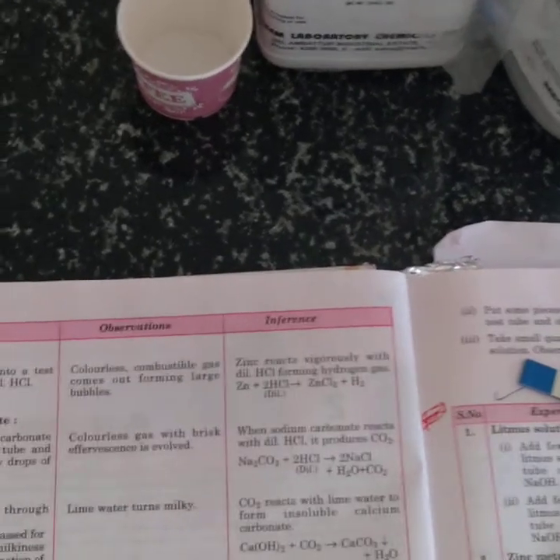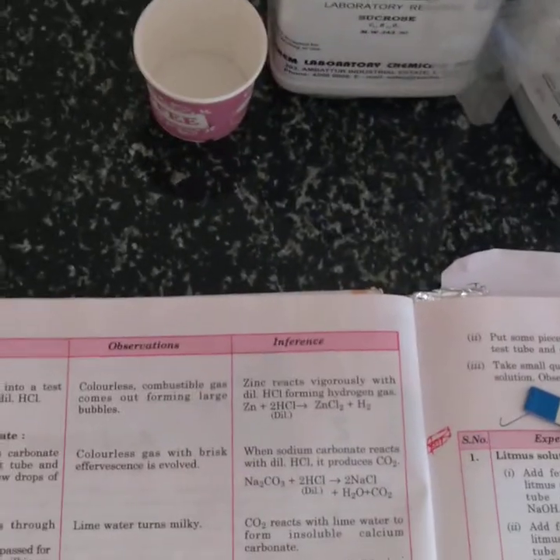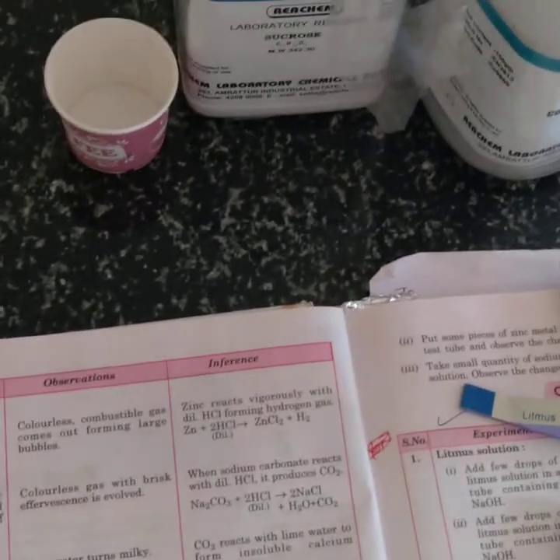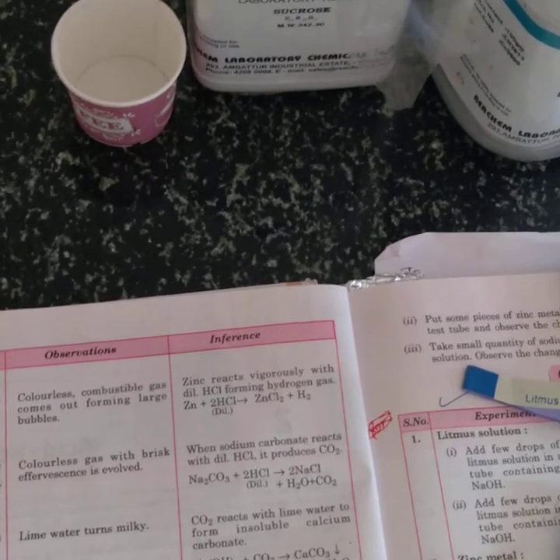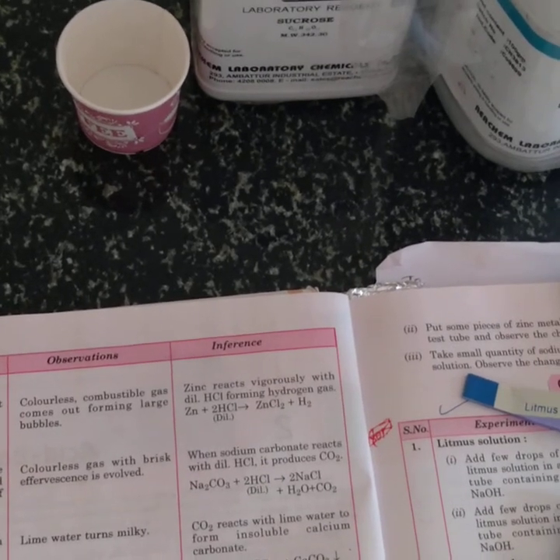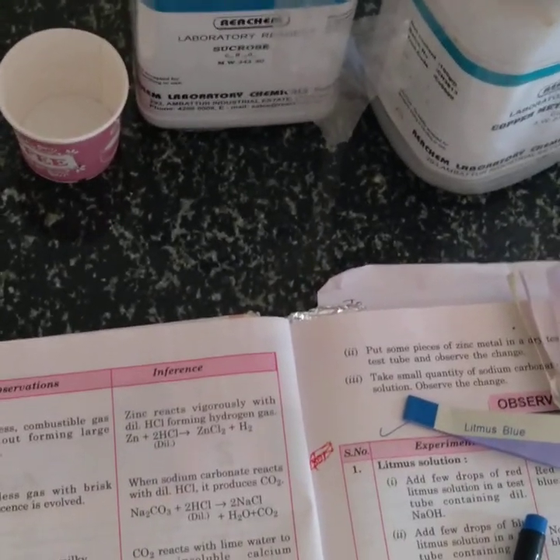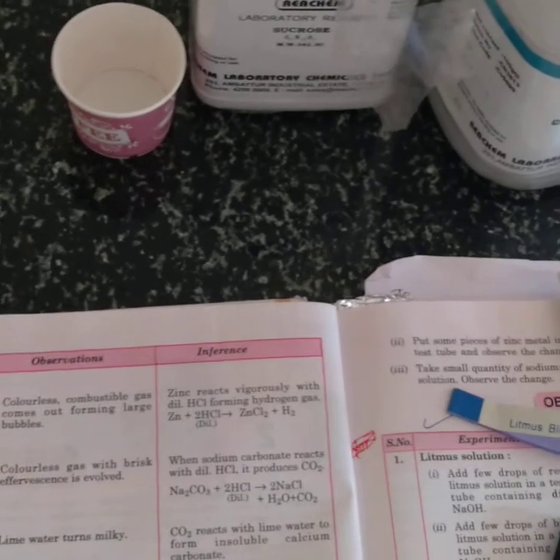Now, what precautions should we take? In the exam they ask you for precautions, sometimes for 2 marks: what precautions you are supposed to take while performing this experiment. Here 2 precautions are given. First, HCl should be handled with care as it may cause burning of skin and clothes. That is why you are supposed to take care while handling HCl, because it is highly corrosive. Second, a small quantity of zinc and dilute HCl should be used for the reaction. Otherwise, a large amount of hydrogen gas will be produced which may cause explosion. If you take a little metal and a little acid, the experiment proceeds to a smaller extent. If you take too much zinc metal and too much acid, it explodes. That is why you are supposed to take these precautions.